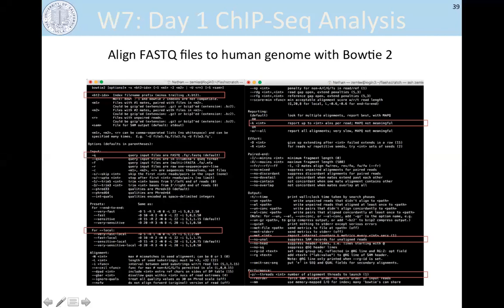If you just type in Bowtie2, it'll show different settings you can use. We're going to use a Bowtie2 index file, which you designate with the -x option. Sorry, this is so small. The -q option that we're putting into the command just tells it that we're inputting a FASTQ file.